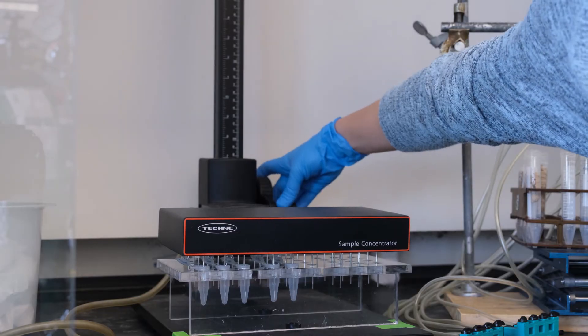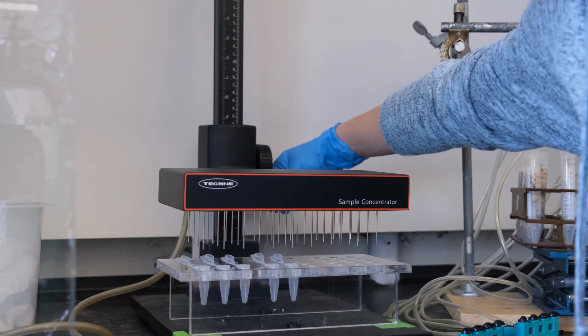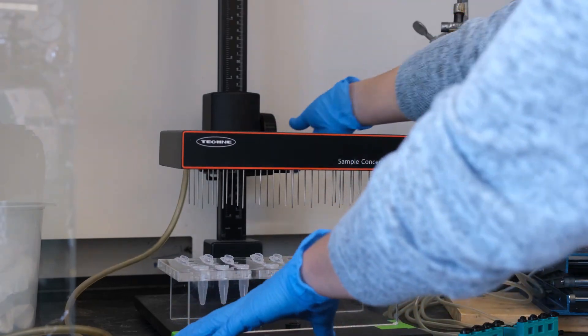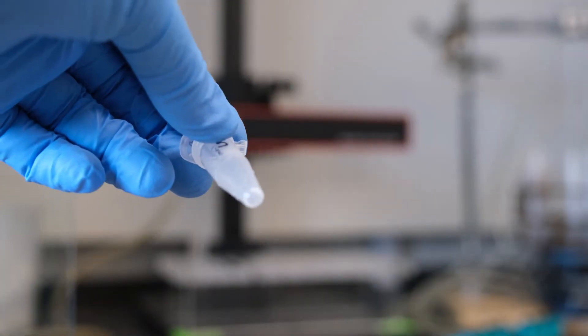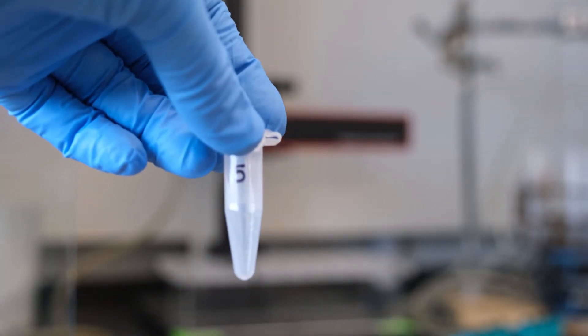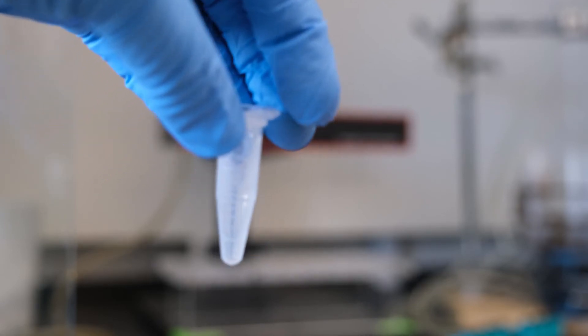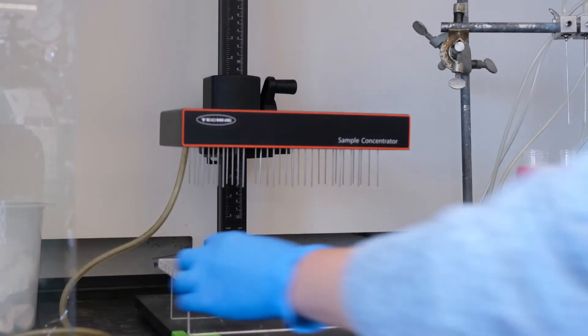When things look dry, raise the needles and remove a tube. Take care not to bump the needles as you do so. Check thoroughly that your tube is completely dry. Remaining solvent will interfere with chromatography. Remove all remaining tubes, checking each to make sure no liquid remains. Place your tubes on ice.